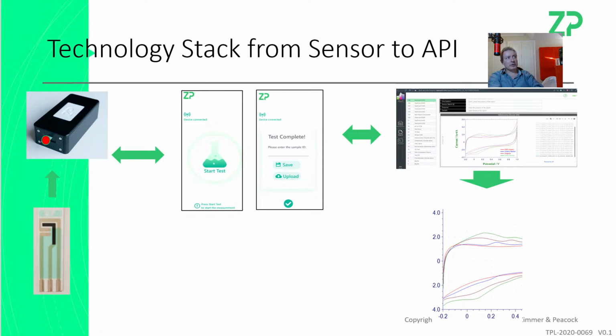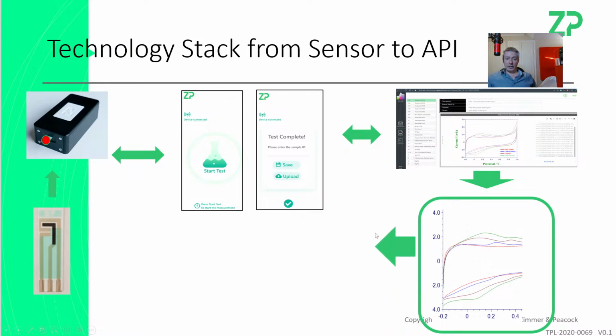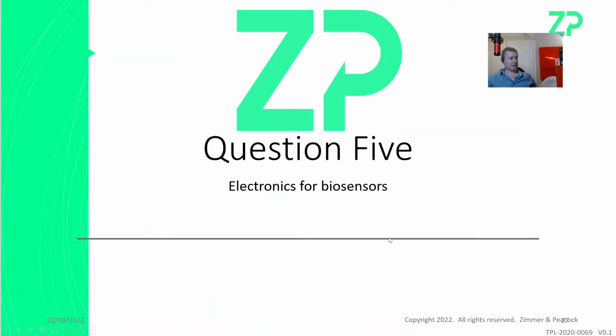It might have some urea in it, but the enzyme should allow you to effectively pull out the alcohol signal. So if you want to calibrate this kind of system, then the alcohol sensors from ZP will work. The Sense It All platform from ZP should work. But then you'll have to do some work with us in understanding. Probably best to have a third-party way of measuring that alcohol in that urine so that we can come up with a calibration curve from that.